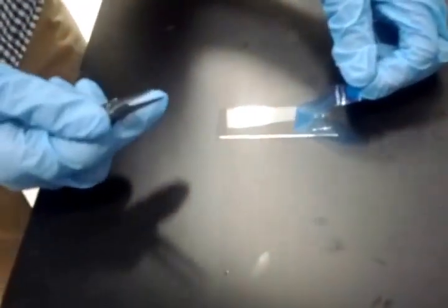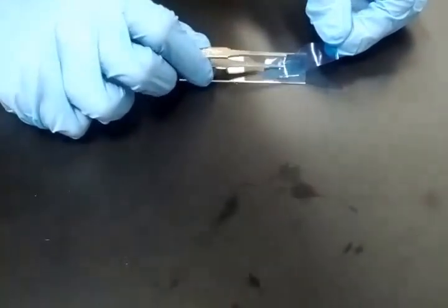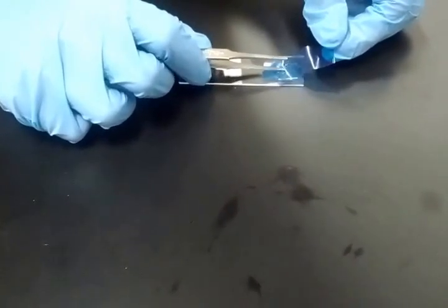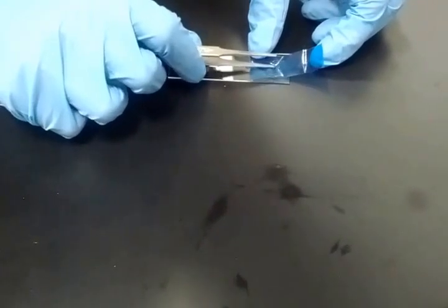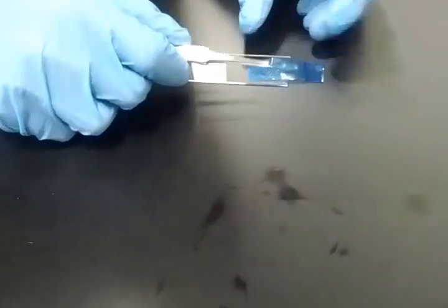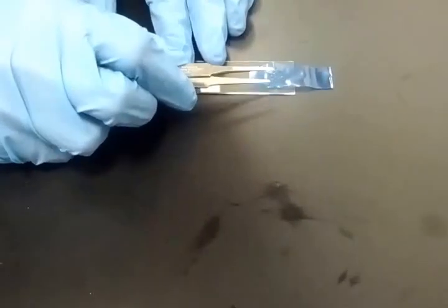If you want a better contact, that means you need to get rid of the air bubbles. So I'm starting from one edge, just like placing a film on your phone. You're making sure there are no bubbles. I'm not pressing much. It's just enough for the contact. So this little droplet caused a problem for us, but it's okay for the most part.